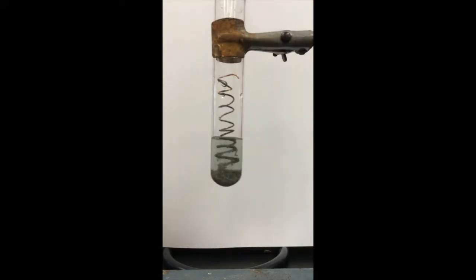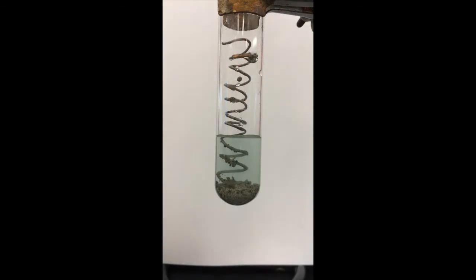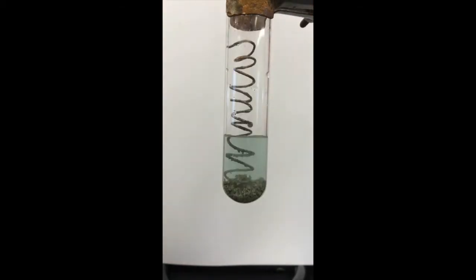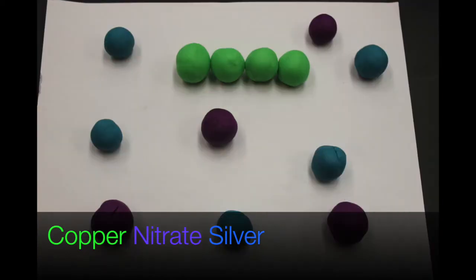Some notable things our group observed during our chemical reaction were how quickly the crystals formed on the copper wire, along with the color of our solution compared to the color of our classmate's solution, which both differed in shades of blue.